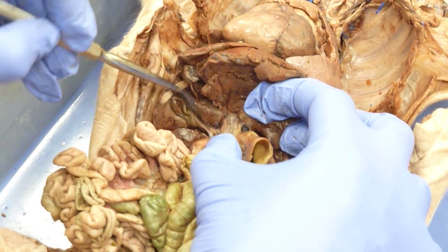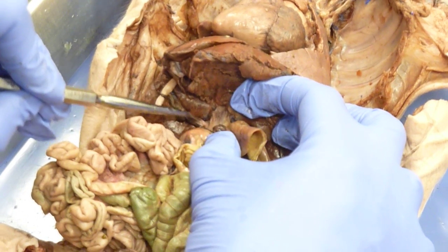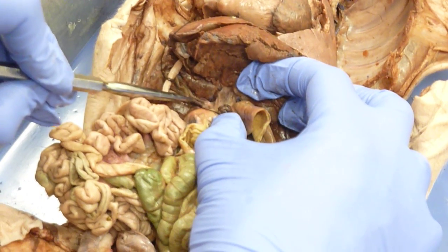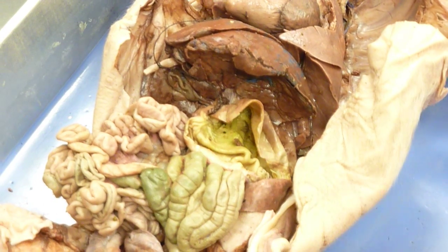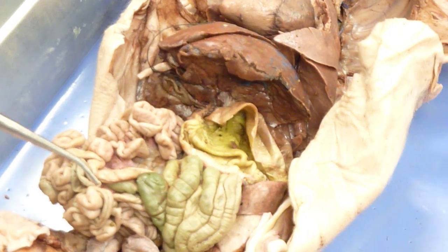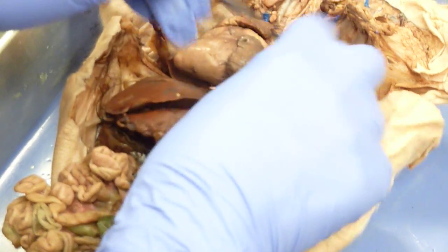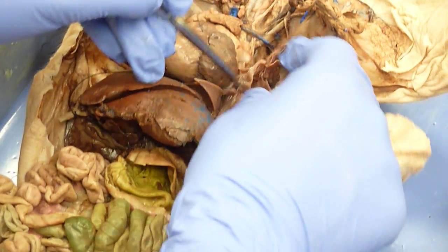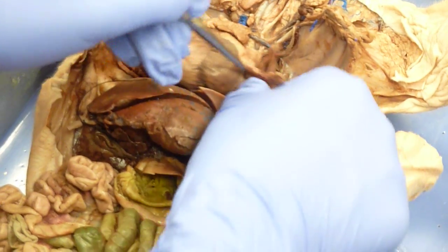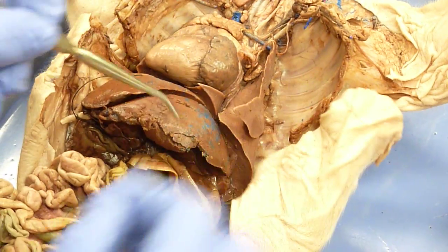And then you can find just the bile duct — see right there. And then are we going to need to know anything more about the lungs, like the lobes? I'm not going to ask that. But I could tease away and actually find a primary bronchi if I actually cleared out the lung tissue.